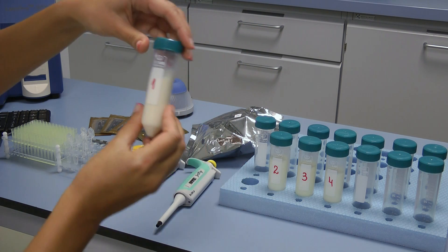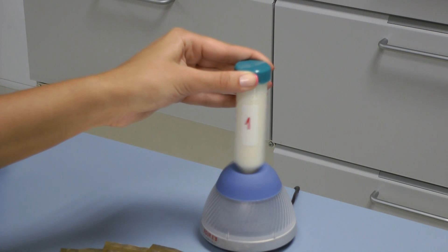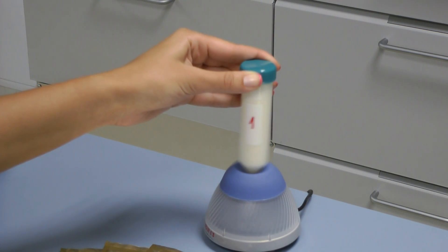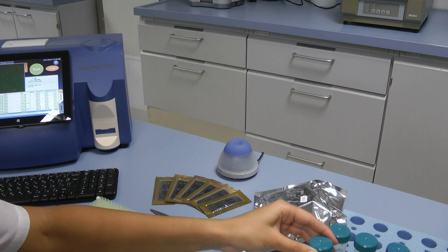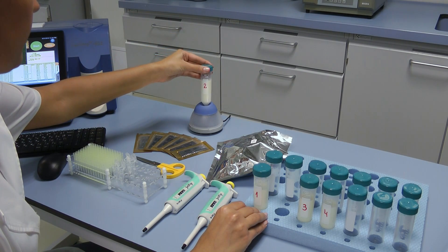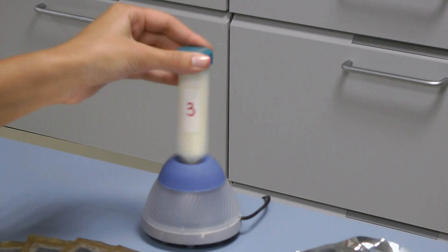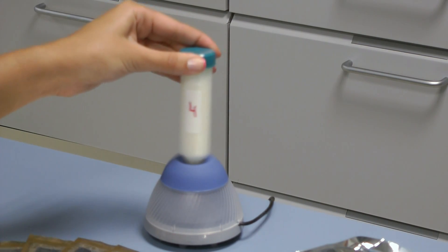Always stir well before taking the sample. Using the mini vortex mixer, stir the raw milk sample as you place the tip of the container in the stirrer, press and keep it pressed for 1 or 2 seconds, then remove it. Repeat it 3 or 4 times, paying attention during the stirring process that the sample does not reach the cap of the container. Repeat the procedure with all the samples.